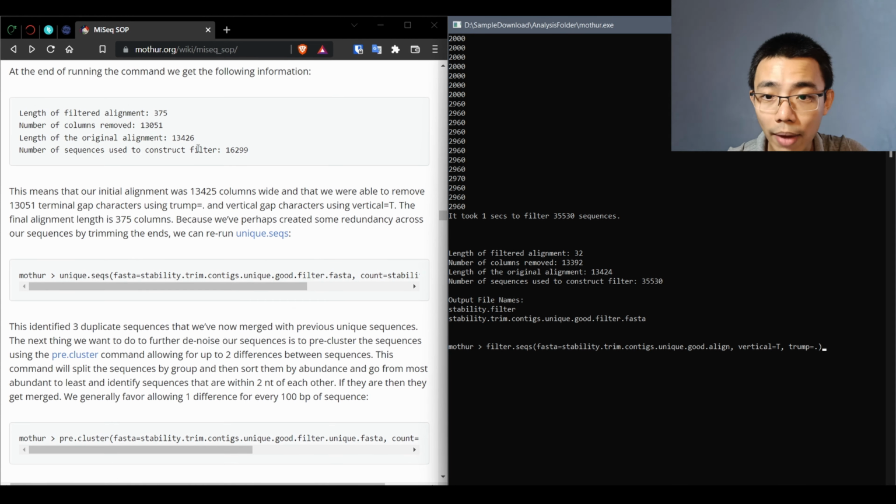Yeah, we can't actually do the taxonomy currently. I have no idea, it doesn't work. Okay, so I think you have to check the output here on the tax summary. Let's just have a look.